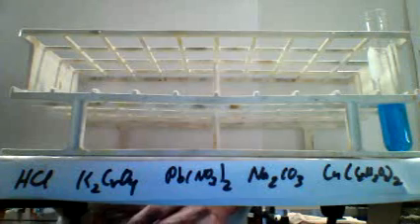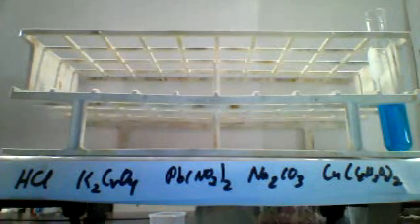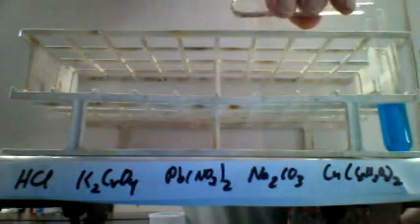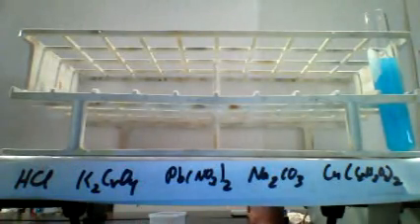And so we want to go on to the next row on our data table. Finally, we're down to our last 2 solutions, the sodium carbonate and the copper acetate. Pour them together and observe the results.